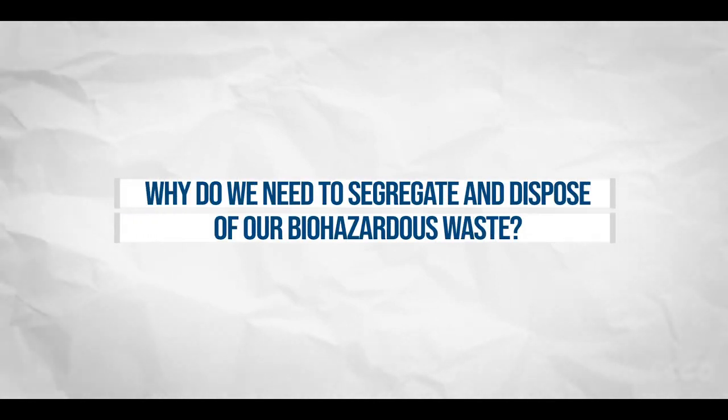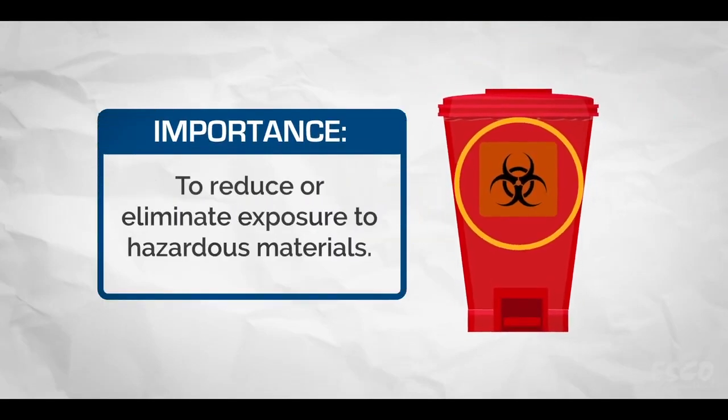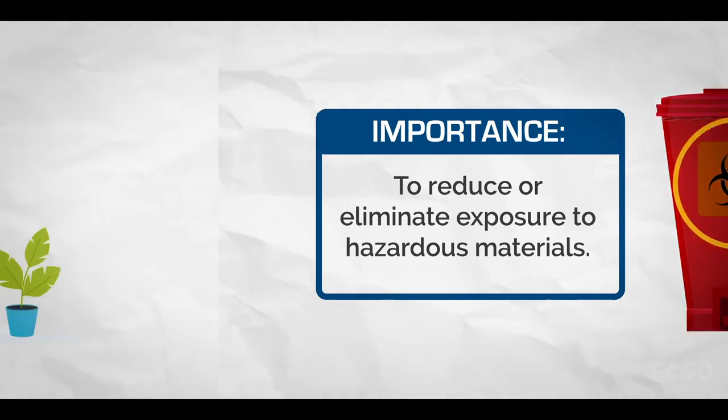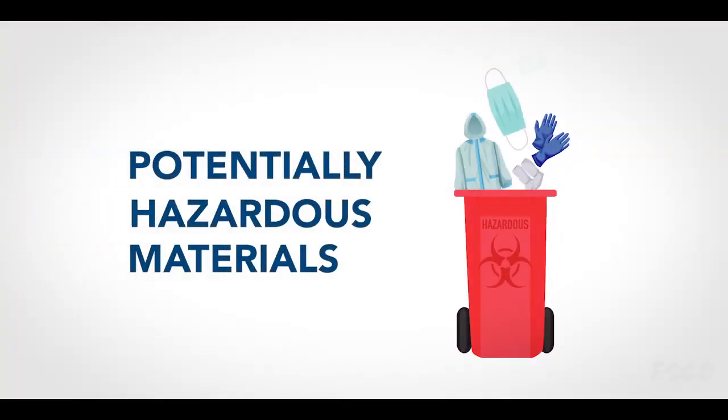Why do we need to segregate and dispose of our biohazardous waste? Correct handling and disposal of biohazardous wastes are necessary to reduce or eliminate exposure of laboratory staff, other personnel, and the outside environment to potentially hazardous materials.